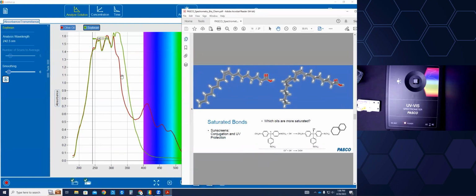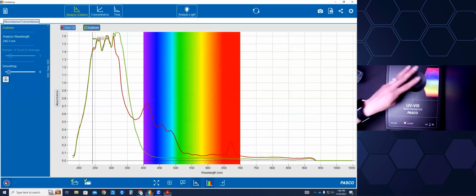So if that's true, I've got this third oil sample here, which is canola oil. And oils are a mixture. They're not just one fatty acid, they're a mixture of fatty acids. Canola oil has both of these fatty acids in it. Let's see if we can figure out which of the fatty acids it has more of. Does it have more of oleic or linoleic? I cannot remember how to say it. Let me start and let's see.